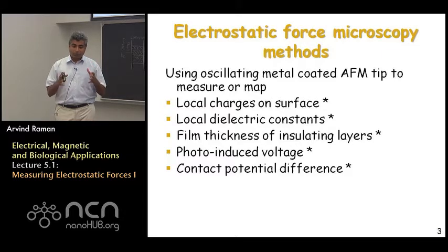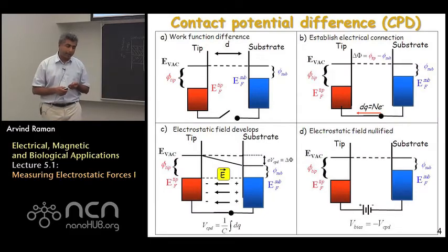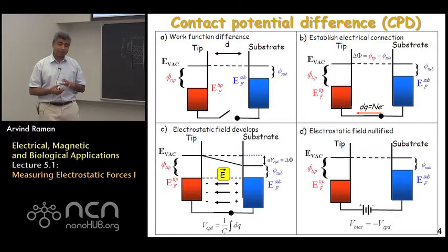So what we'll try to focus on in this module is understanding how the Kelvin probe microscopy method is used to understand work function differences on substrates. Now, in order to do so, we need to do a little backup, and I'm going to go to the board now and talk a little bit about the electronic band structure of crystalline solids.